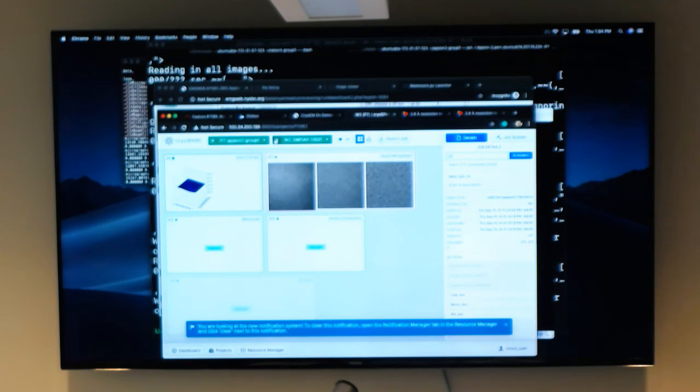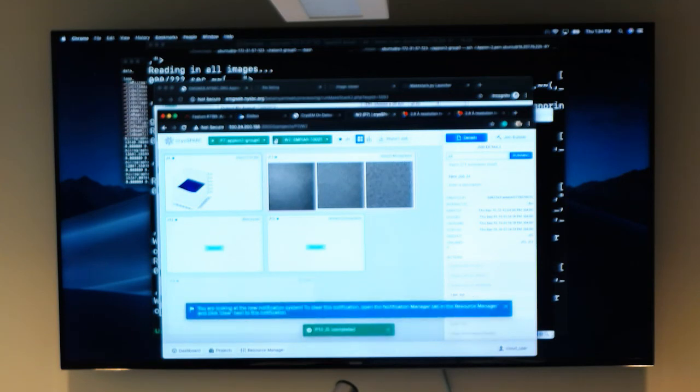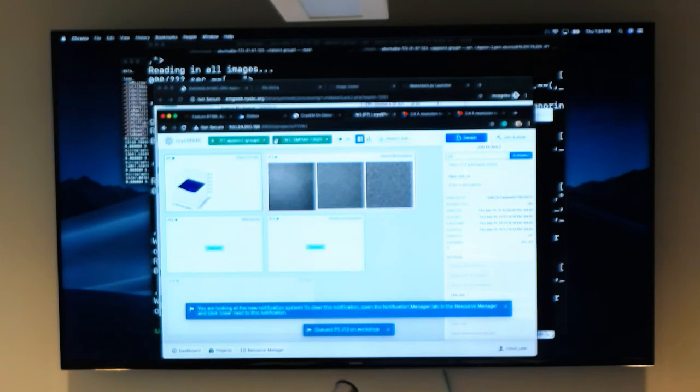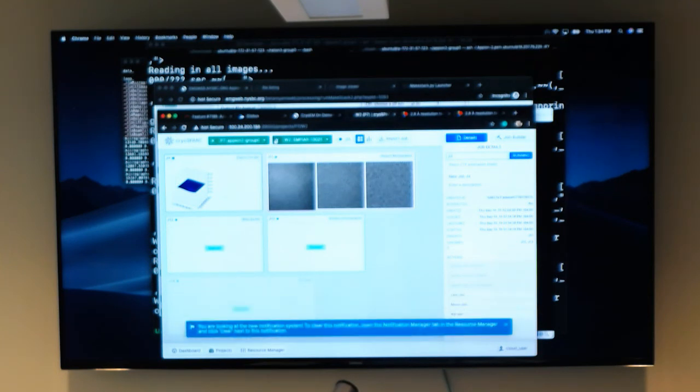I just wonder how it looks like. Yeah, homogeneous. That's where it's down. So we can just list that.